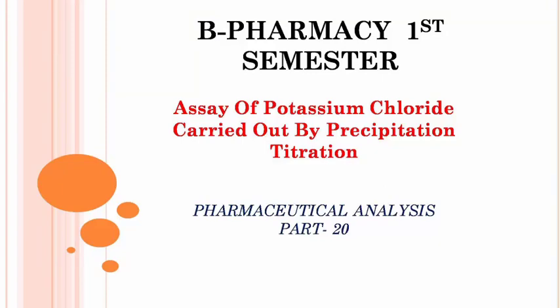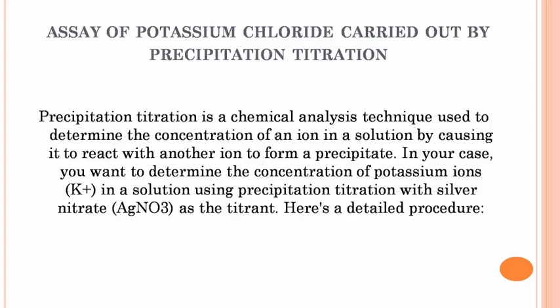In this video we are going to study about assay of potassium chloride carried out by precipitation titration. So let's start the video. Assay of potassium chloride carried out by precipitation titration.